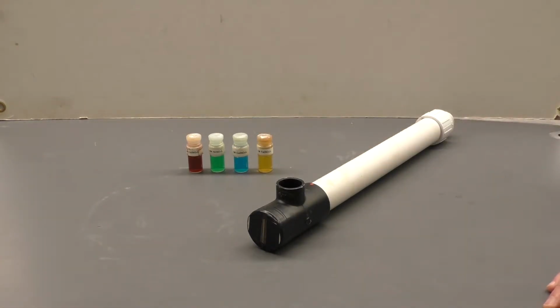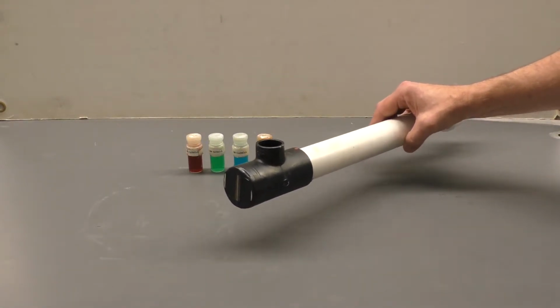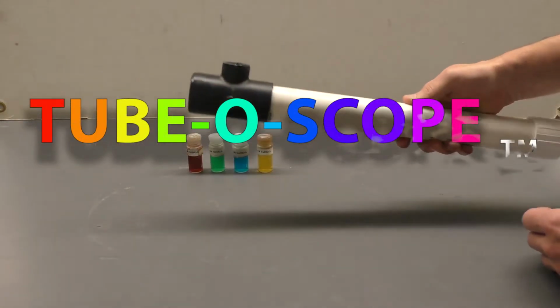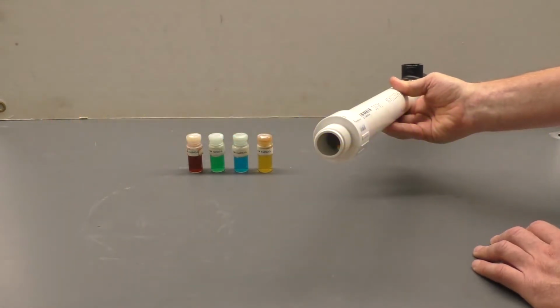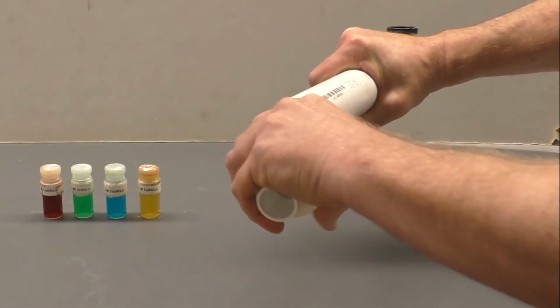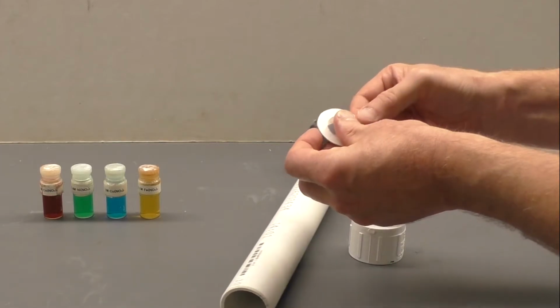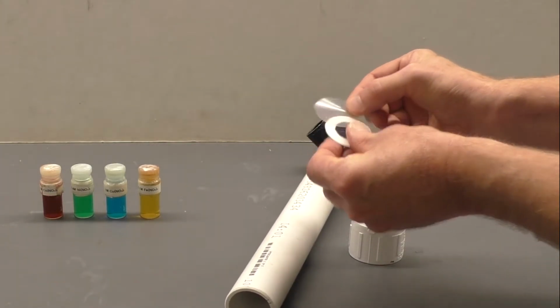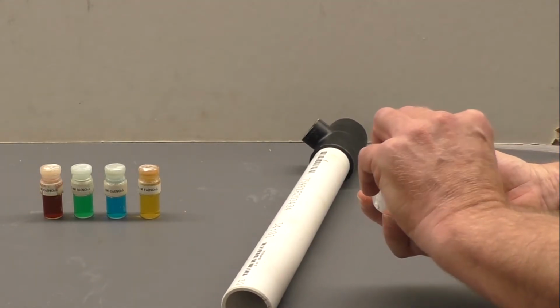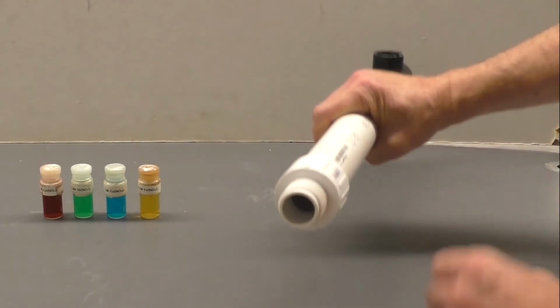To investigate that, we're going to use this other type of spectrometer. It's just like any other spectrometer. It's a homemade device. We call it the tuboscope. The tuboscope is a long tube. At one end, we have a diffraction grating that we're going to look through. You can see that if I take it apart, there's a little diffraction grating in there. Just like the boxoscope that you looked at last week, same thing. The difference is that we've made it a little bit more robust.